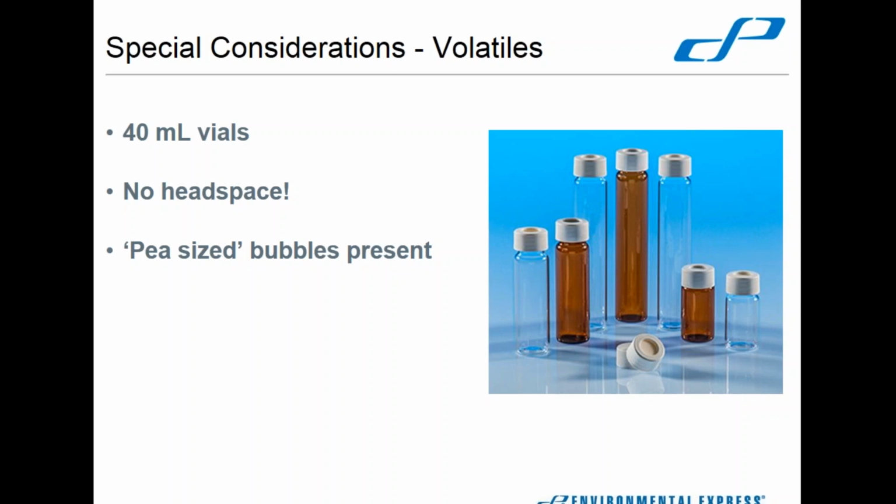Most of your volatile organic samples are collected with that septum, that rubber septum on top. And that's a special composite of materials, some blend of a nice cool rubber material and PTFE. Those are the most common layers that you get. And that's designed so that the sample collection vial itself actually goes directly onto the instrument that will be analyzing it.